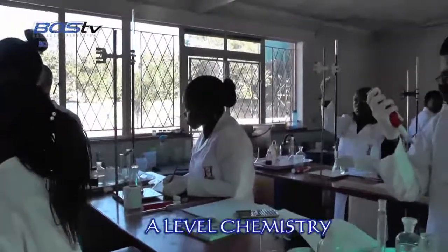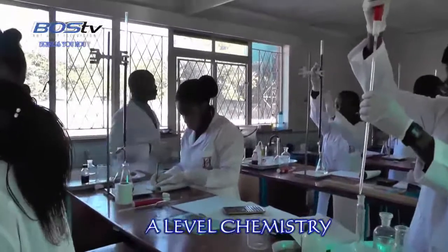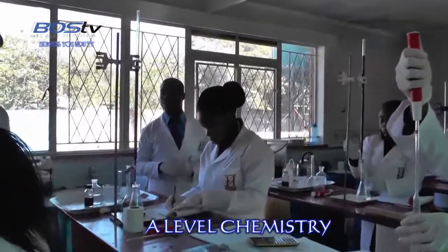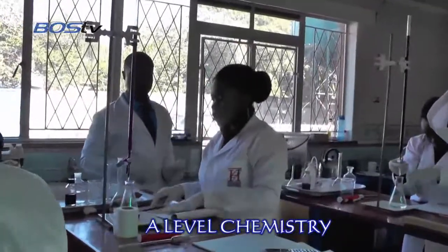Yes, about 3 that are accurate. 3 accurate titres. Don't overshoot the end points. Don't overshoot. Do the next titre. The next titre.